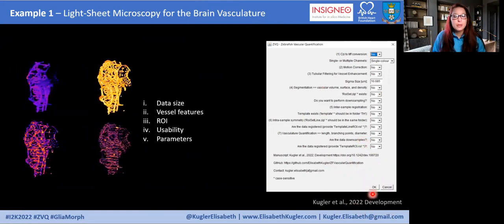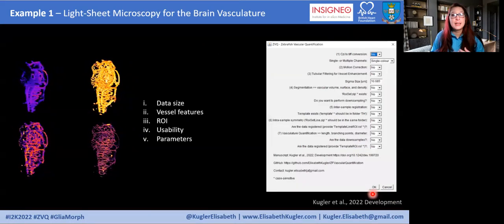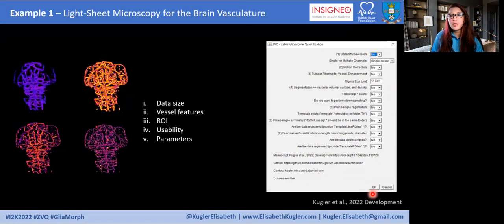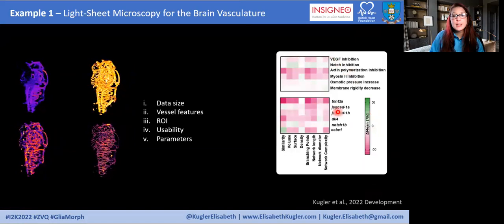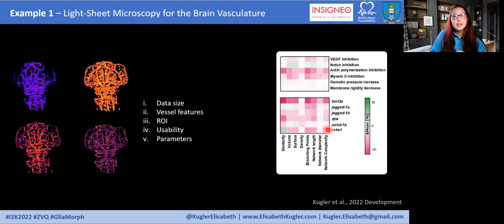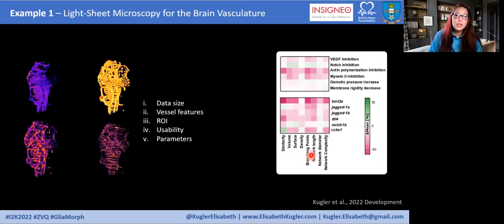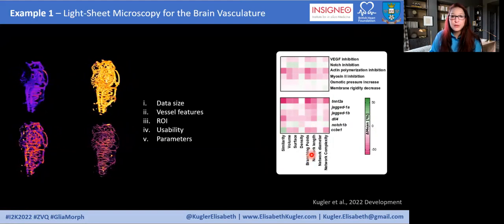But I just want to very briefly showcase that in this study, we not only developed a tool, but to make it even more open and user-friendly, we also showed applications to different drug screens as well as morpholino-based knockdowns, to show how we can combine different screens with these data analysis approaches. Today I don't want to talk about the biology, but I want to come back to what this means from a computational point of view.